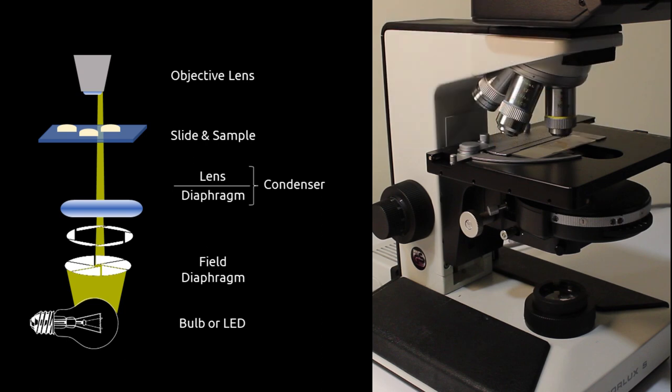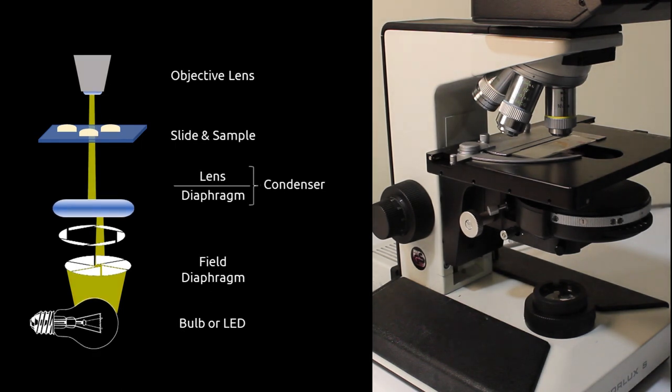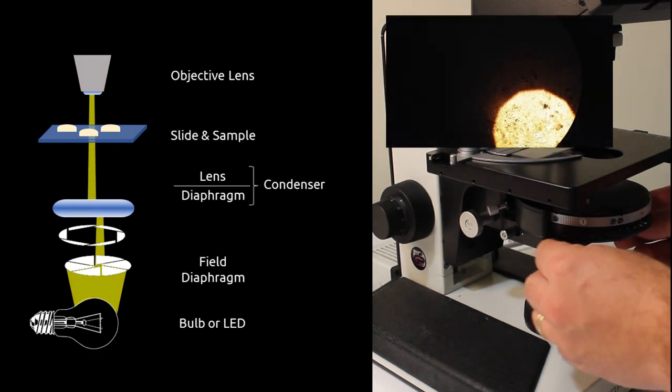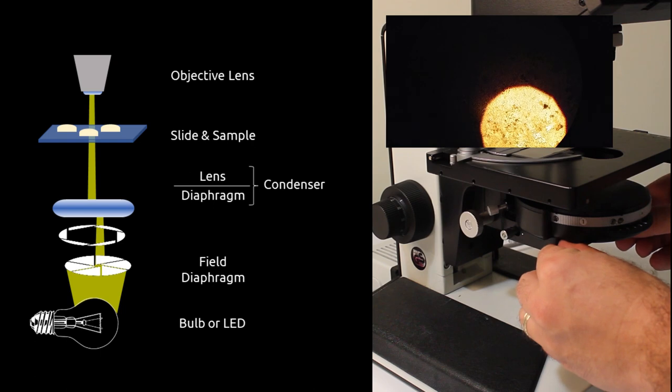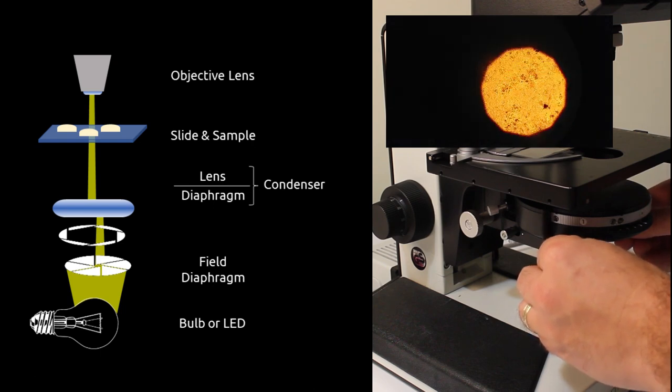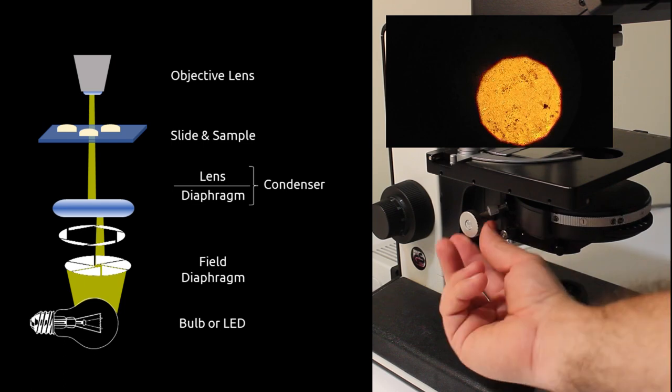We then want to center the illumination into the center of the objective lens. To do this, turn the adjustment screws located on either side of the condenser to move the hexagon to the center of your field of view. This now means that we are focused on the field diaphragm and we have centered our light source in the middle of the objective lens.